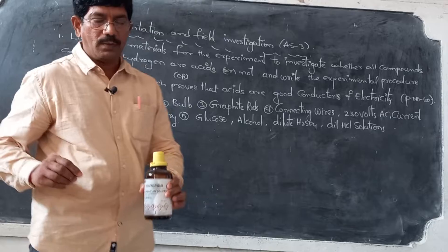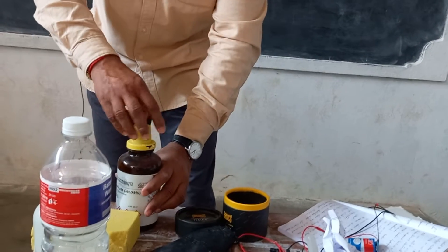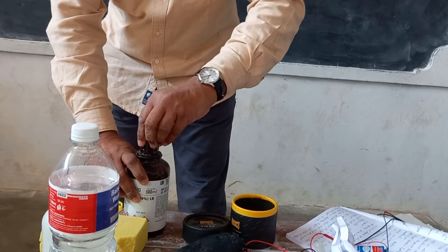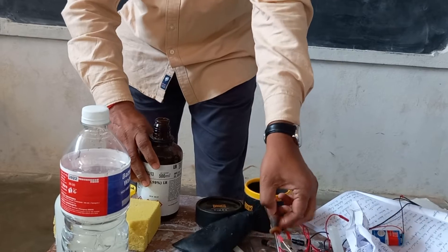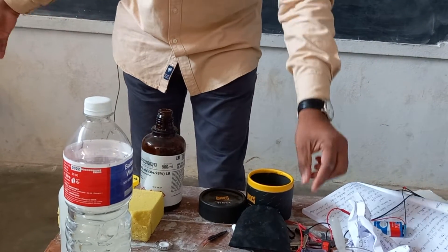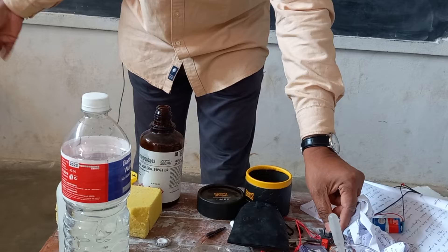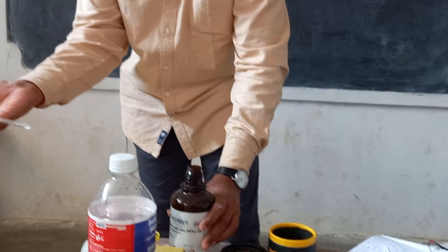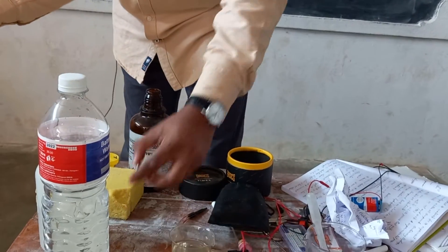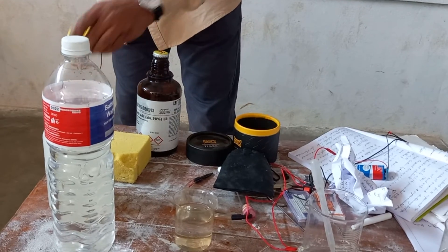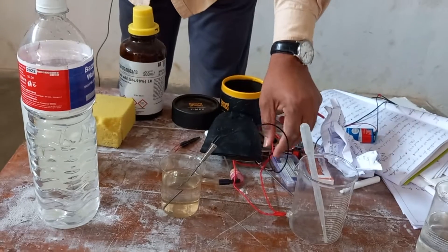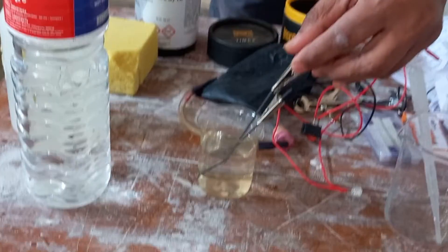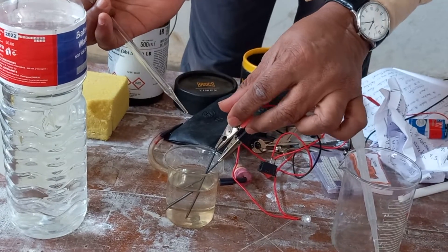Next, I am adding concentrated sulfuric acid drop by drop. We must be very careful while using concentrated sulfuric acid. Observe the changes that are taking place as I add concentrated sulfuric acid drop by drop.